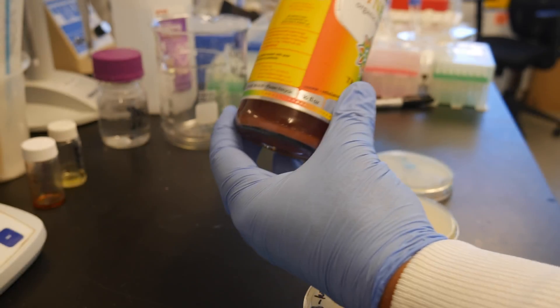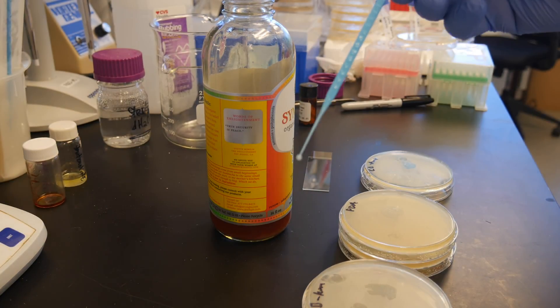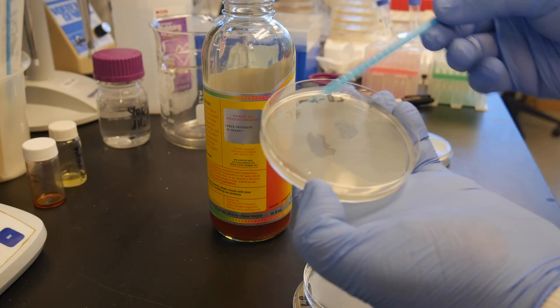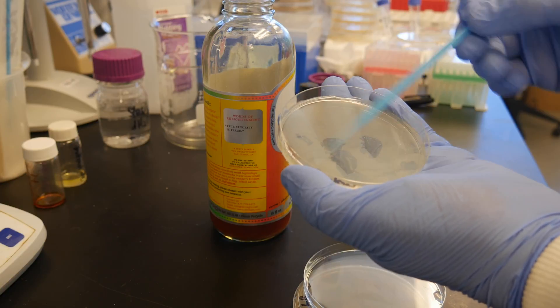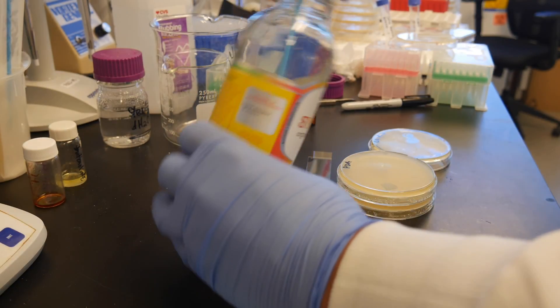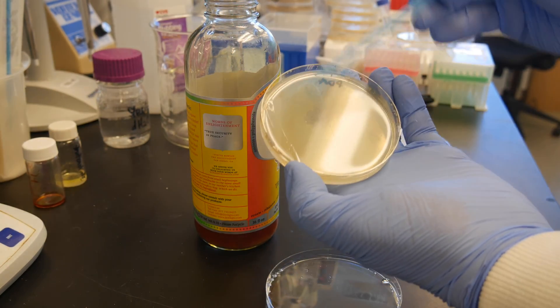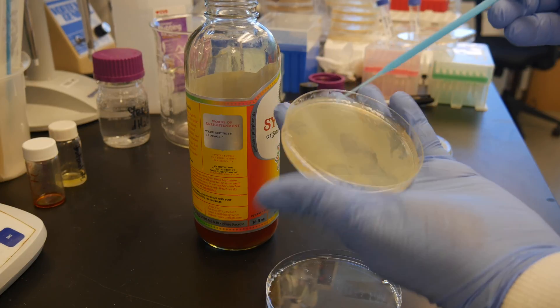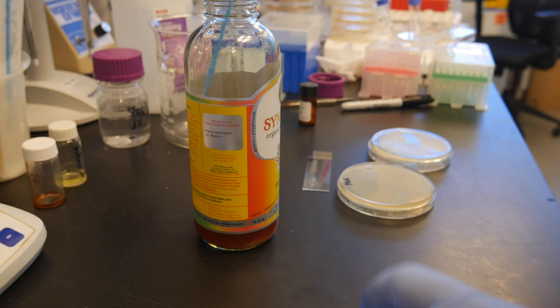I'm going to dip this swab in here, try to get down to the bottom. Really all you need is just a tiny bit on the end of this swab. Do a little simple isolation streak. Dip it again, and do one for the potato dextrose agar, and one more for the LB amp.